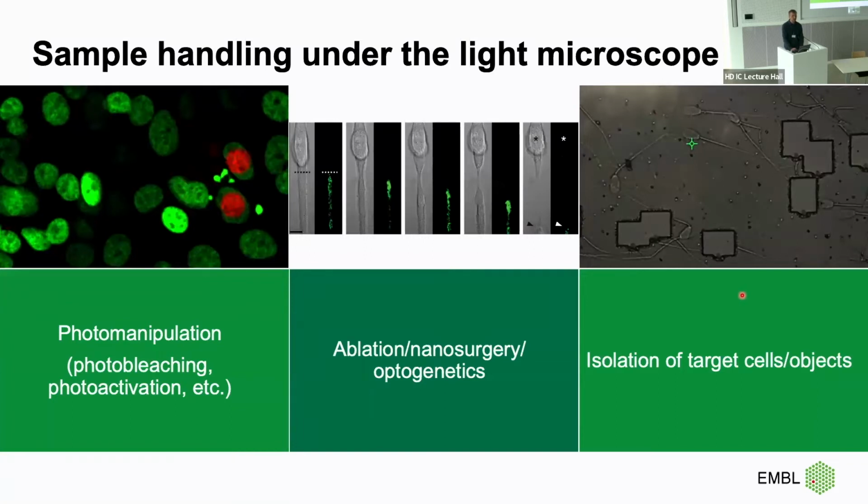And again, very often we end up making more than one decision at a time, right? So you need to define not only the cell, you not only define the position which you move to, but you need to identify the cell to photoactivate. Just to mention a few projects.